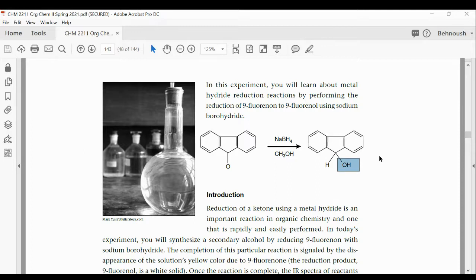So did I answer your first question? Yeah, thank you. Okay. So if the reactant changes to product and you are taking the IR of the product, you don't want to see a peak at 1700. If you are taking the IR of the reactant and you know it's pure, then you should not see a peak for OH because this is the reactant.